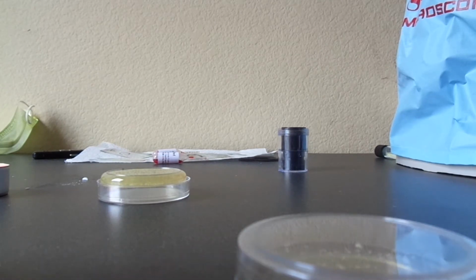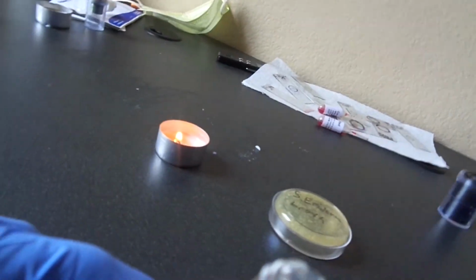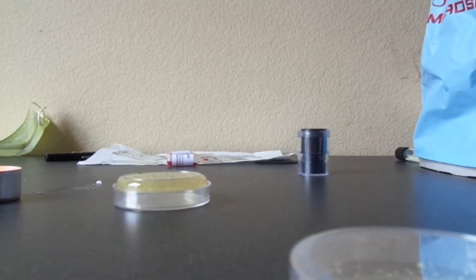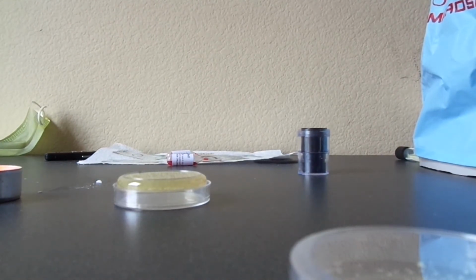It's interesting. If you see here, it's kind of like blocking. So let's see if I can get that to go down. The idea behind this one is you're supposed to be able to trace the growth of the bacteria, so it does have to be kind of solid, but it seems like mine is a little too solid there. Okay, so I do see.